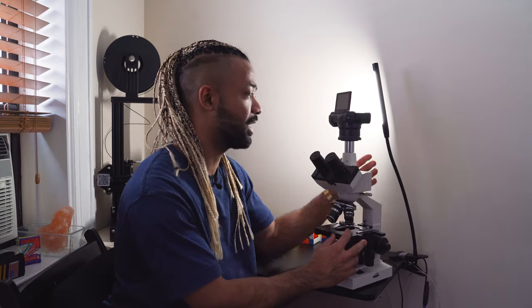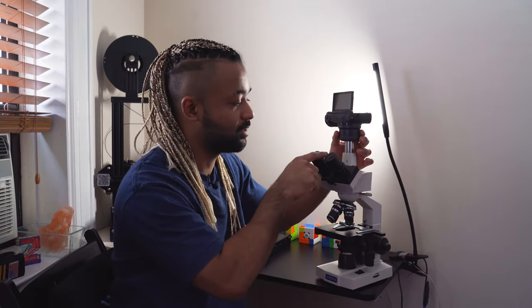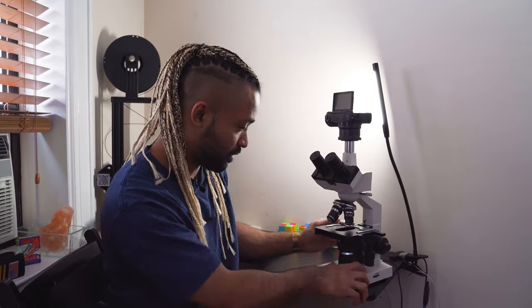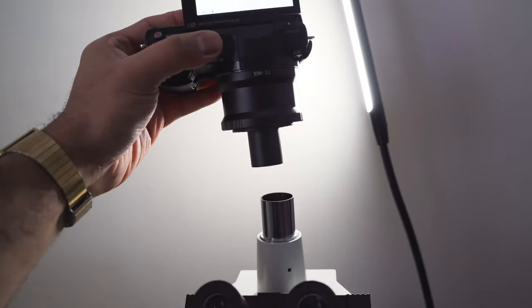And the reason why I got a trinocular is because you can add a digital camera onto the top, onto the third piece. So one, two, three, and you can take pictures, videos of any sample that you're looking at. I'm not gonna get too much into detail with this microscope. You got your camera. This is mad cool, man. Look, how cool is that right there?